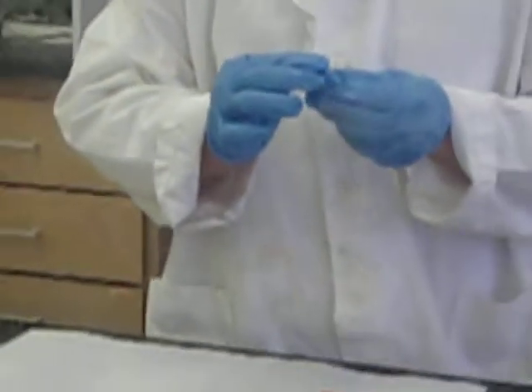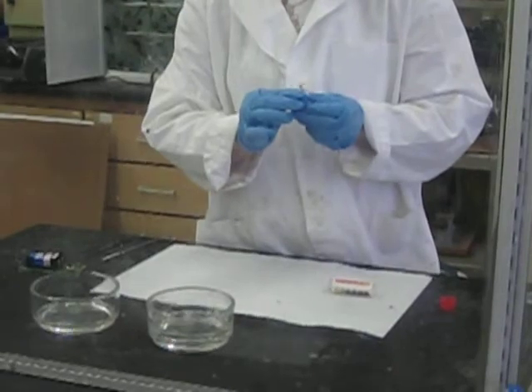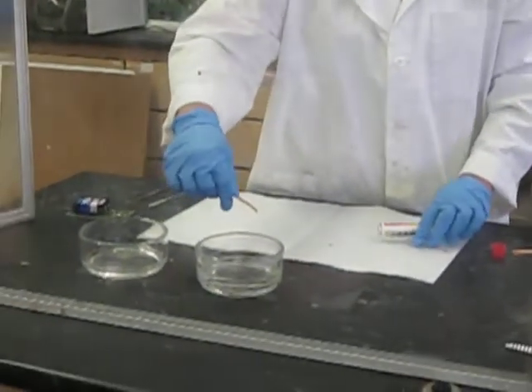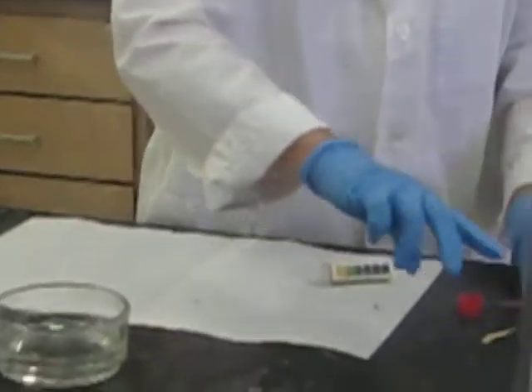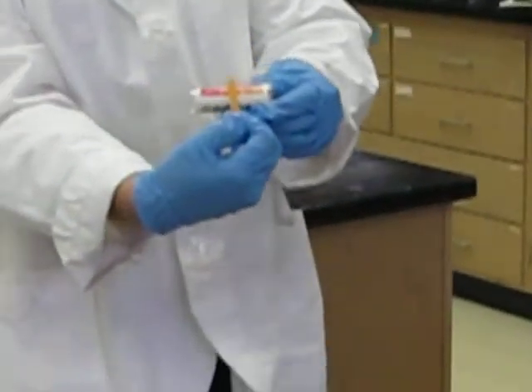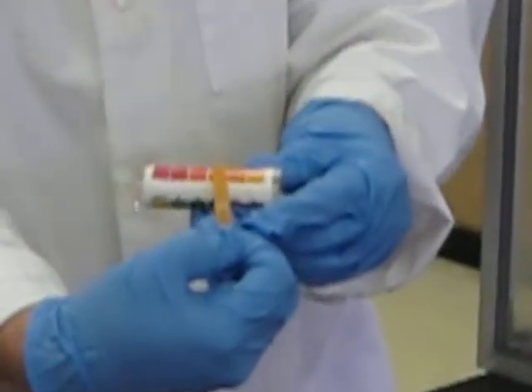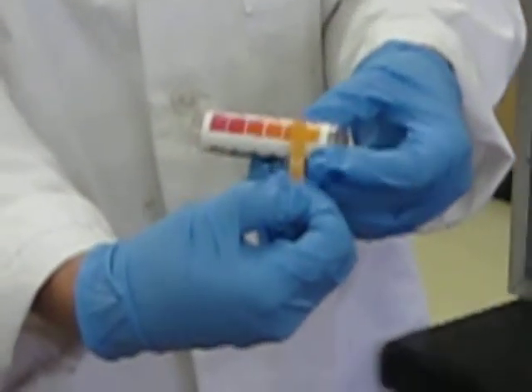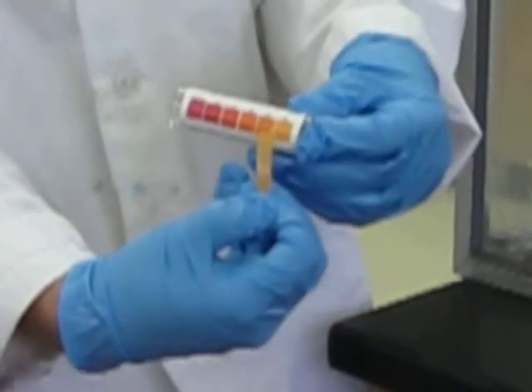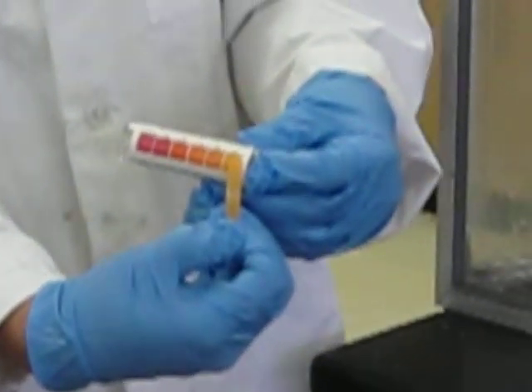Low. And then we're going to take the pH of the water before the chemical reaction. So just take a piece of pH paper and dip it. And it's contaminated. That's not a good thing. So we dip, and then we're just going to match up. To match the pH, we match the color. And what do we get for pH? It's not a 12. 6 or 5? 6. Okay, so you're going to record your pH as 6 for before the chemical reaction.